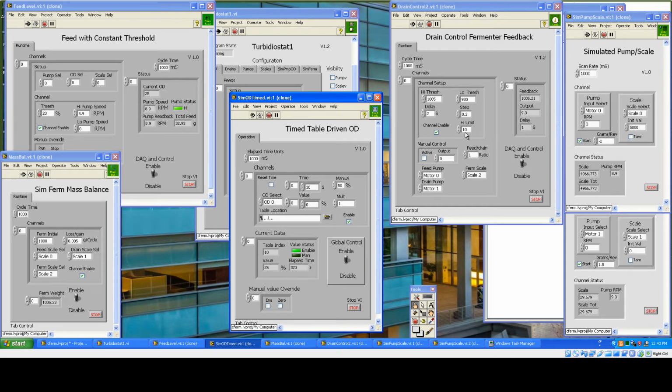Notice this will only increment by a step after a delay of 2 seconds. This delay really is simply to allow scales to settle and things like this. 2 seconds is, in our experience, generally more than enough for a scale to stabilize.